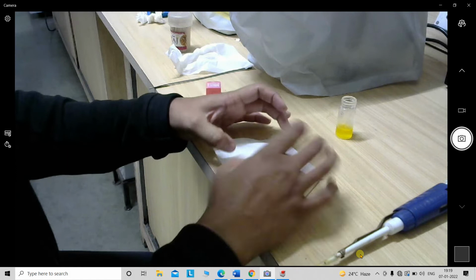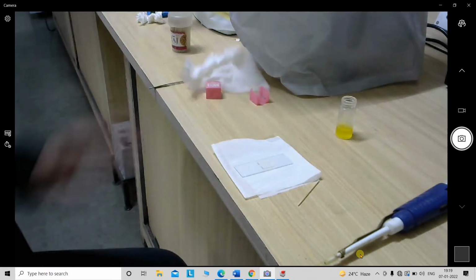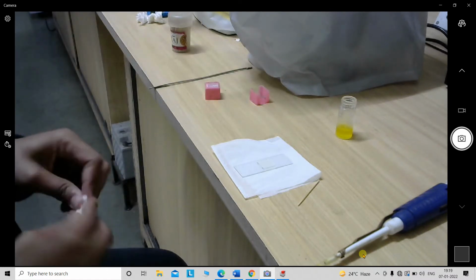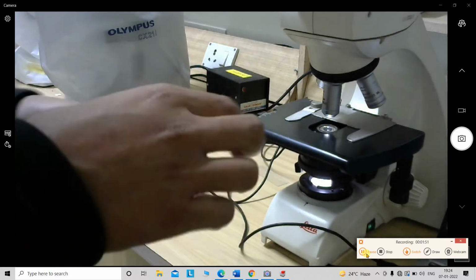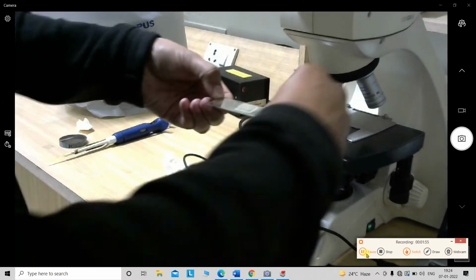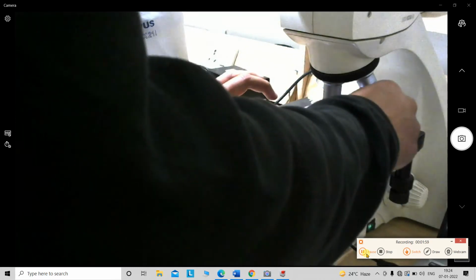Okay, so now our slide is ready. This is the slide that we have prepared. Now I'm going to put this slide in here, as we have seen in our first video, right?